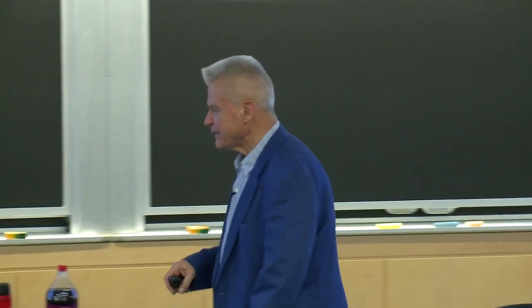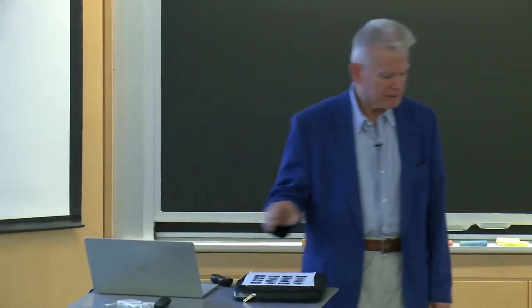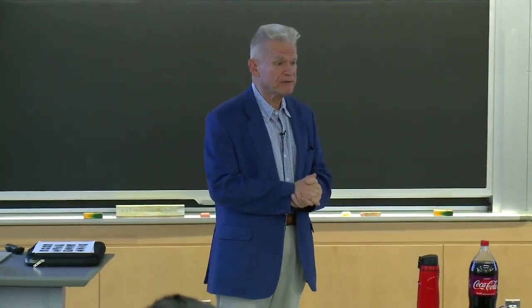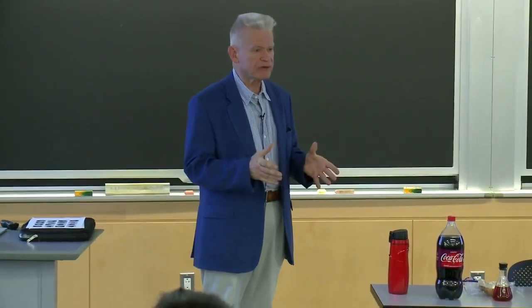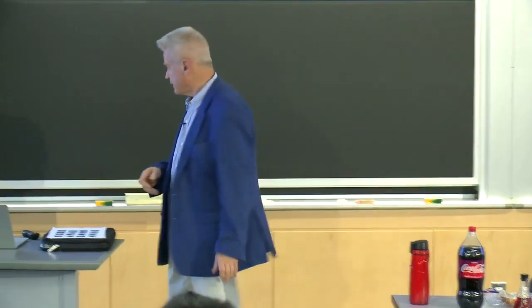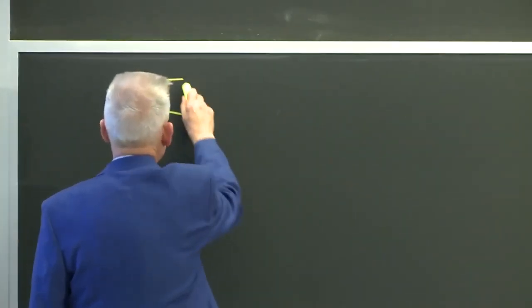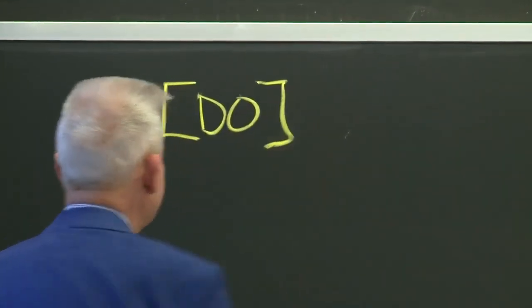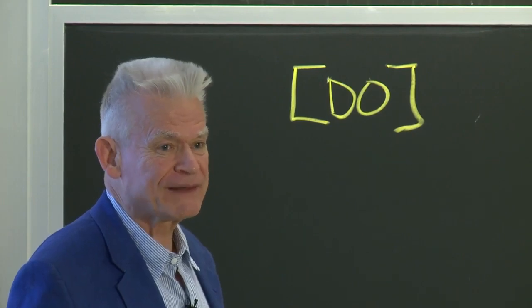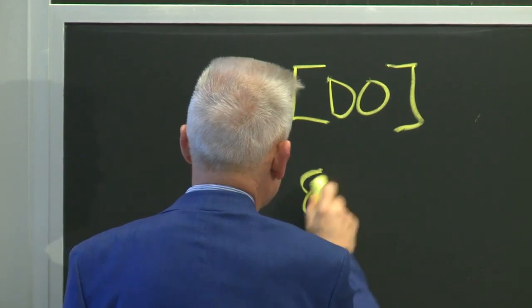So we're going to get started, and I'm going to start off by talking about probably the most important parameter in measuring the health of the river, and that's the dissolved oxygen. When we look at the dissolved oxygen concentrations, for a river to really be healthy, we're looking for something greater than about 8 ppm.